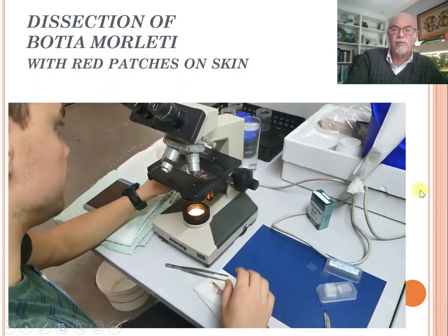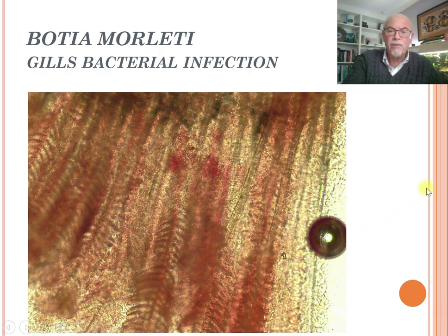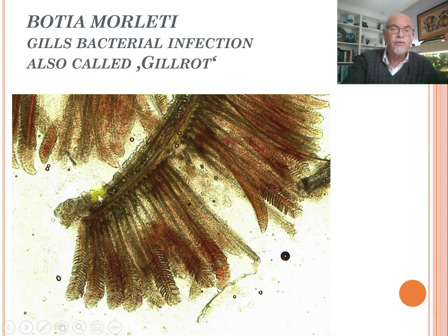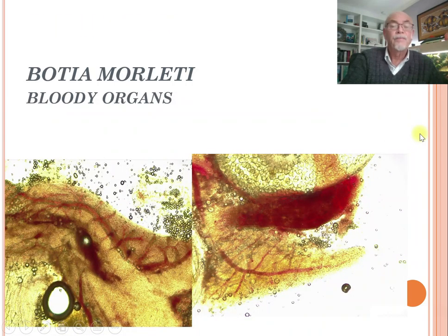Now I'll show you what we found on this fish after Beren Basler completed his examination and dissection. Looking at the gills — the reddish bleeding parts — we see gill tissue that is rotten away and damaged. Here is another damaged part, and more gill tissue that is partially or fully gone. We can see in more detail that this is usually caused by bacterial infections — we call that gill rot.